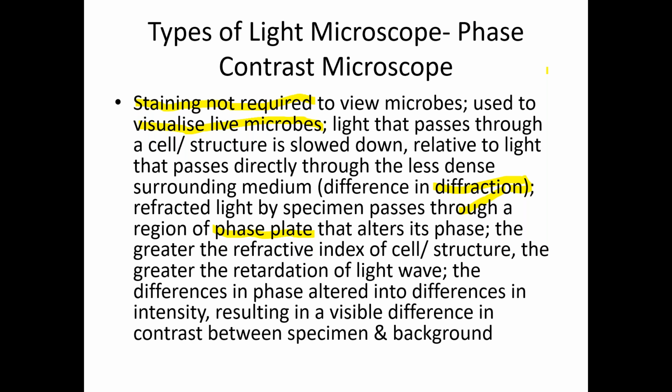It is very simple if we explain it in a simple way. On the glass slide, you will have a microbial cell or smear. Light will hit the slide and pass through the microbial cell, and also through the unstained region at the side of the glass slide.